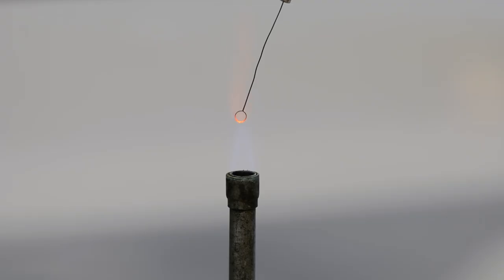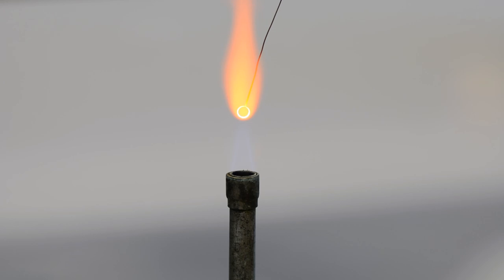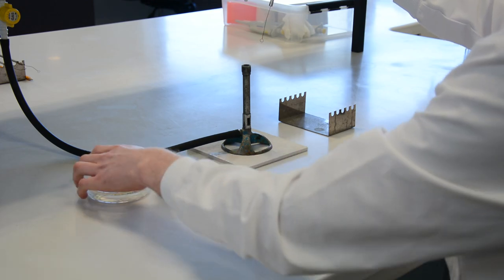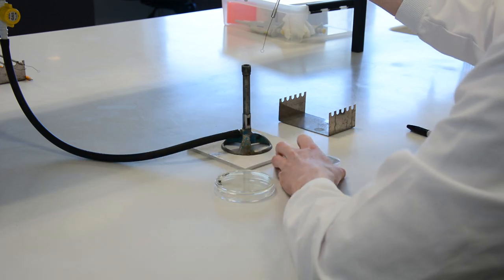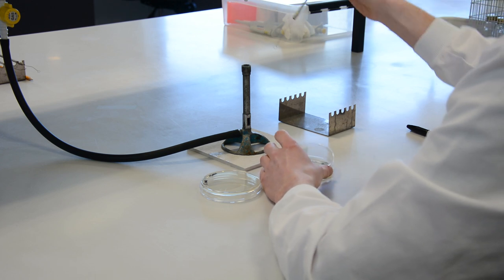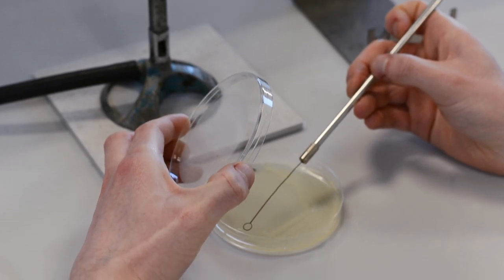To streak plate, we use a wire loop. We sterilize it before use by holding it in the hottest part of the Bunsen burner flame, reasonably vertically, so as much of the loop and wire as possible can be heated. It is now allowed to cool as a hot loop will kill the very microbe that you are intending to culture.